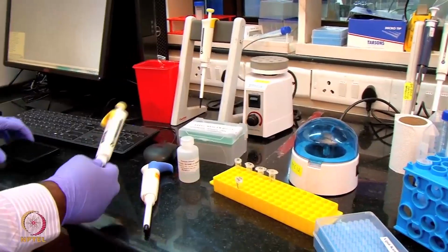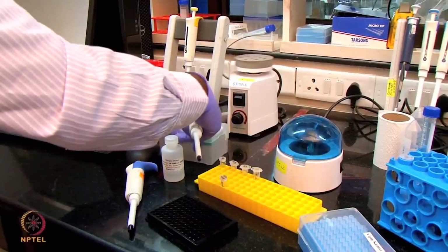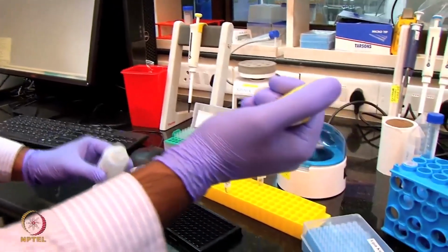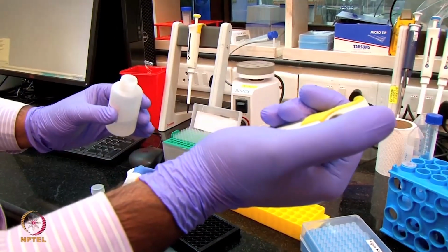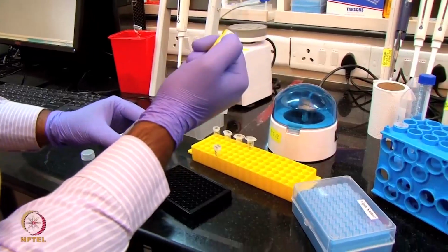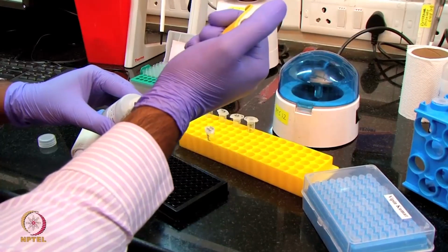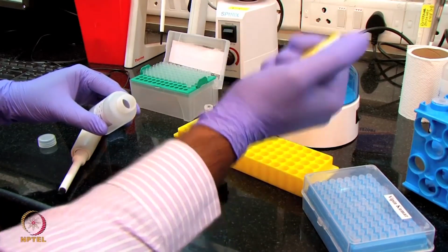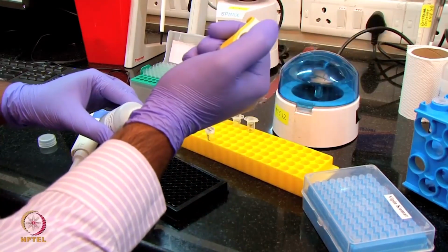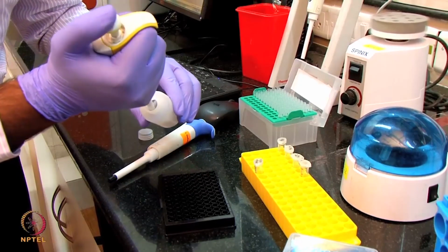Prior to that, I'm taking this 96 well plate and adding the buffer into the wells. I'm going to use around 6 concentrations, two-fold dilutions. So I will add buffer here. I'm going to do the dilution in the plate itself. So 200 microliters each of the sample diluent buffer I'm placing in 6 wells of the 96 well plate. And I'm going to use 3 wells as references. Just plain buffer used as a reference.